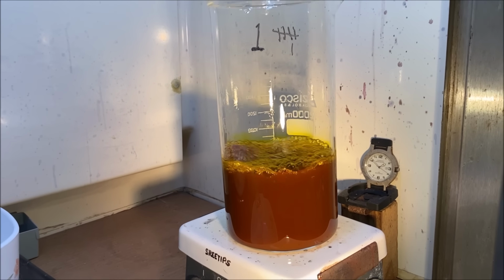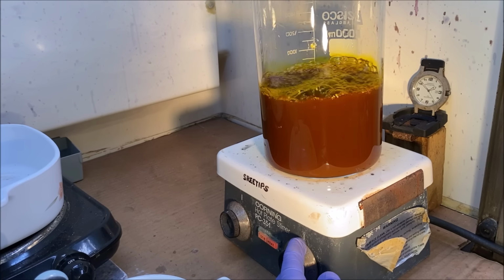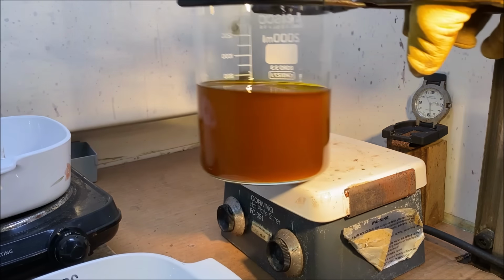Reach down here, turn the heat off, and let this cool down. I'm going to take it down off the hot plate and set it down here to cool.